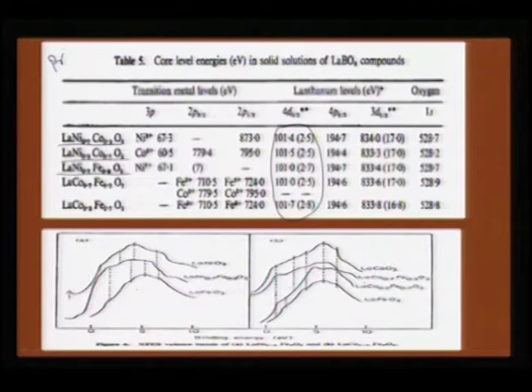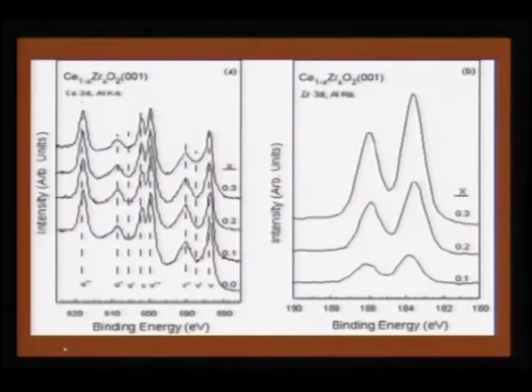Lanthanum in general can show a very precise number, and so is the case for oxygen 1s. You would hardly see any change happening unless a peroxo species is present. So, when we have these perovskite compounds, taking a look at the lanthanum and oxygen positions can be a useful calibrant to see whether the effect is predominantly coming from the mixed valence states. So, the features of such XPS spectra are given here, and this can also be used for a methodical study.